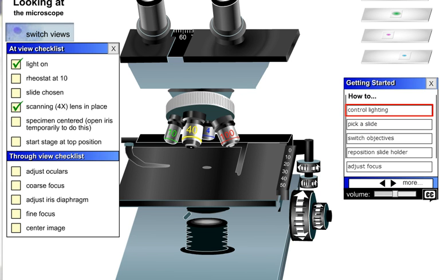And I'm not going to have him do the whole thing for you, because you'll be able to watch that yourself. As you go over these, you see each of these slides. And the one that's out of your range there is the letter E, which we'll start with. So I clicked on it. And when you have a real microscope, you have some kind of a clamp that holds it in, and it needs to be in straight. So I've picked my slide.